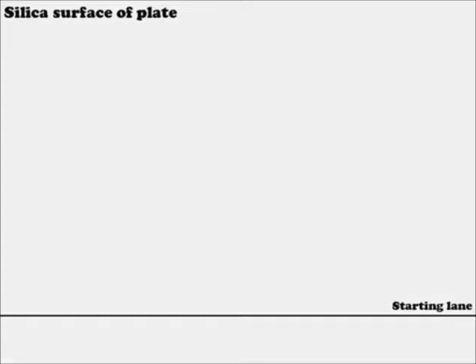At this point, we're going to spot our compounds or mixtures of compounds onto the plate. For demonstration purposes, I've created spots of pure purple compound and pure yellow compound. Now that the spots are in place on the starting lane and appropriately spaced, I'll introduce the mobile phase to the system and allow it to wick up from the bottom to the top of the plate, carrying along my analytes at whatever speed they may go depending on their partitioning behavior.